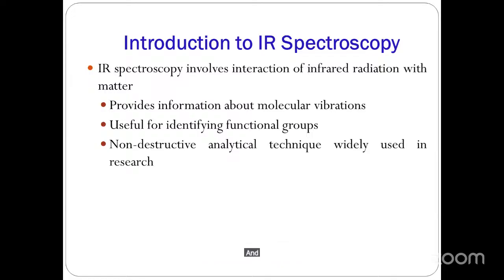It tells us information about molecular vibrations, and it is quite useful for the determination of functional groups present in the sample. An important aspect of IR spectroscopy is that it is a non-destructive technique, and we can recover the sample which is analyzed using IR spectroscopy.